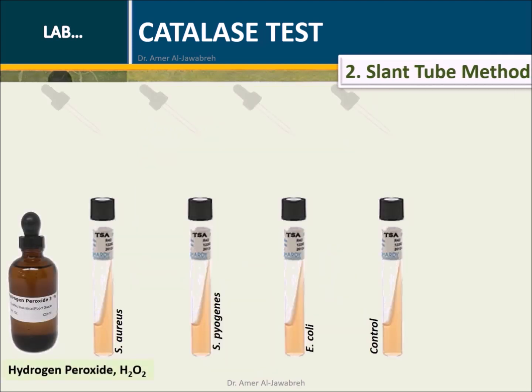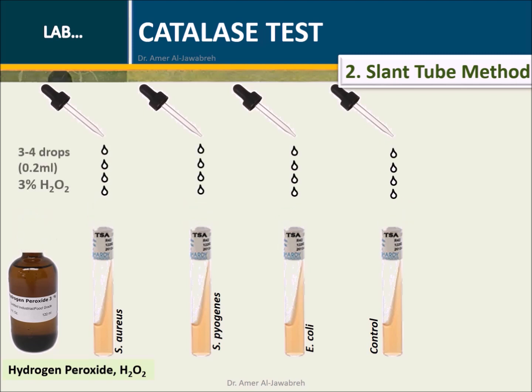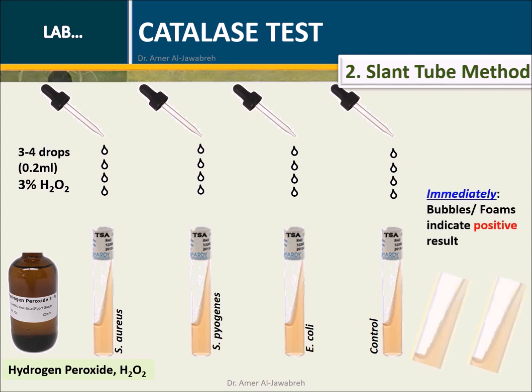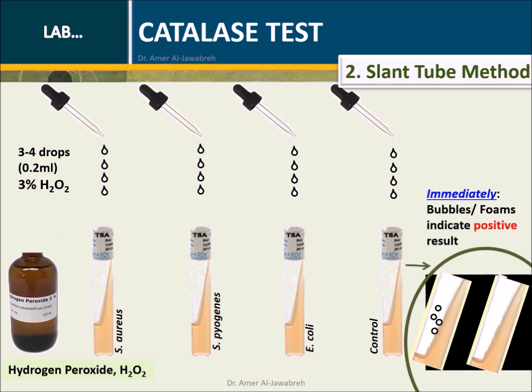Slant tube method: Prepare three slants of bacteria and a negative control with an uninoculated tube. Allow three to four drops of three percent hydrogen peroxide to flow over the entire surface of each slant culture. Observe for immediate bubble formation.